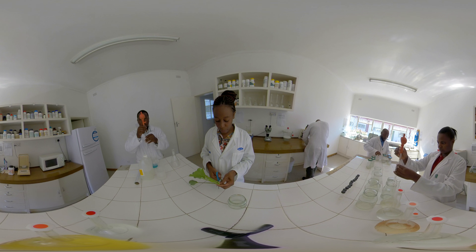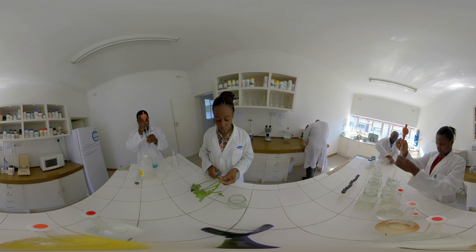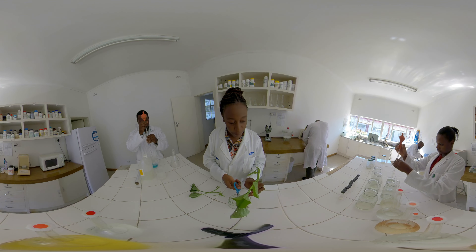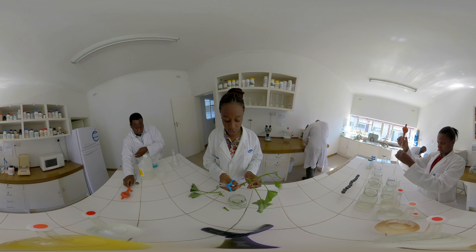On my right, Mr. Mgabe is preparing stock solutions for our disinfectants, which we use to sterilize the lab. On my left, Molin Mgabe is preparing media for our tissue cultures, and on my far left, Mr. Mtsaru is loading the autoclave with prepared media for sterilization.